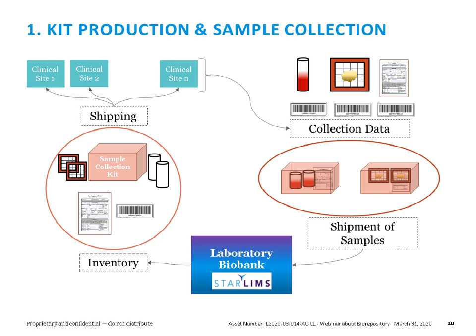It is now becoming a biological sample, and all of the collection data associated to it will need to be part of it, and that is something that could be collected perhaps in a paper form, the traditional way, like if somebody has to be entering all of this data manually in a paper form. But there could be also other better, more efficient ways to collect all of this data.